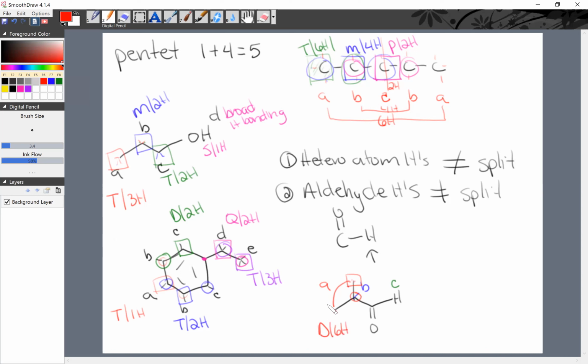So imagine how many hydrogens the boxes are hiding, and that is a total of 6. So that is a doublet that should integrate for 6. If we're looking right here, now we're looking at its neighbors, which are here and here. So it's self plus 6. We're just going to call that a multiplet, but it's only integrating for 1 hydrogen, so it should be tiny.